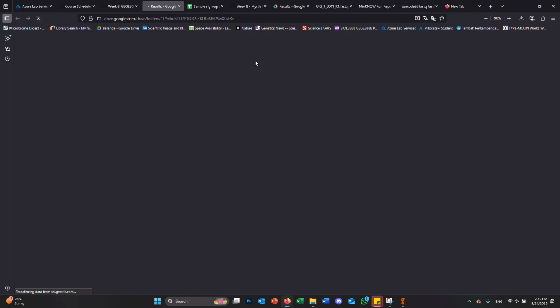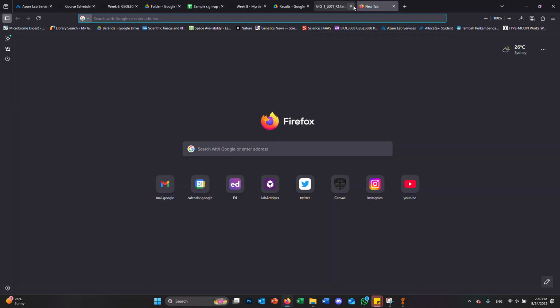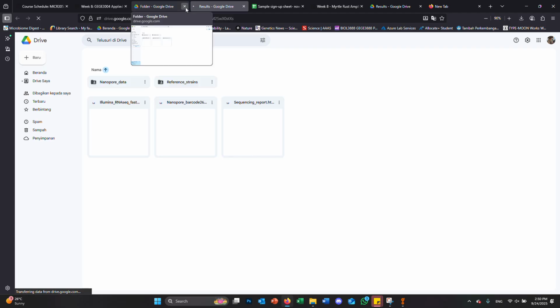Once you've imported your FastQ, it will give you a few different tabs along the bottom. You can look at the sequence view, you can look at the length, text, etc. I want you to just have a quick scan of the QC report and you will be able to see the quality of your reads.